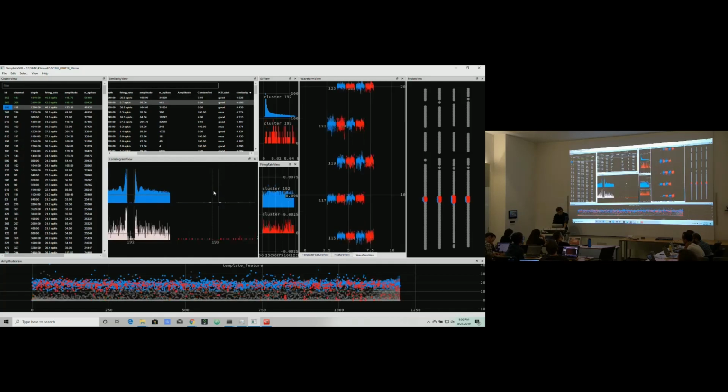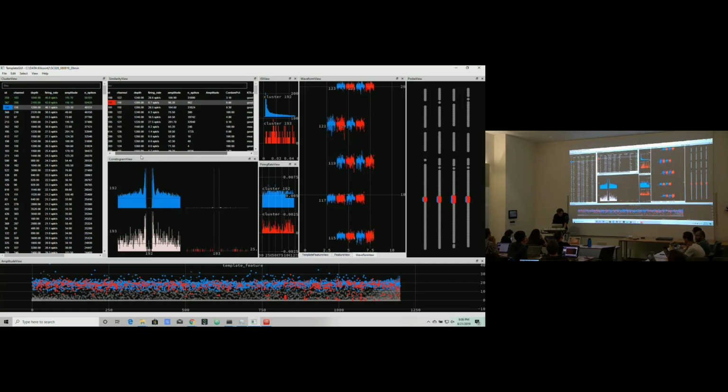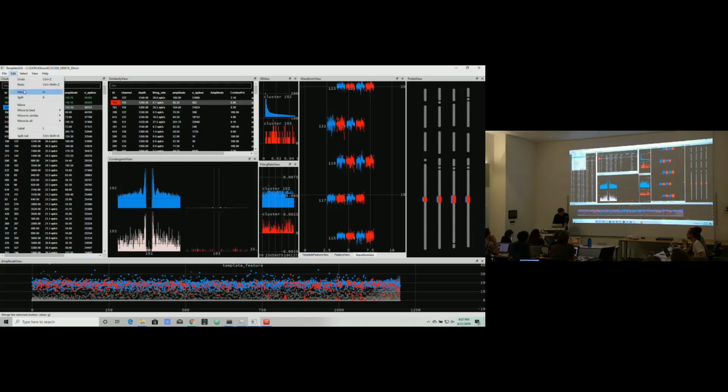Okay, so that's not it. This could be it very much, but this neuron has very few spikes. So maybe it's the same. Here's what happened: this neuron has lots of spikes, 48,000, and something was probably carved out of it, some 800 spikes. And if you want to do curation to get those spikes too, then you could merge them. So I will do this, G.